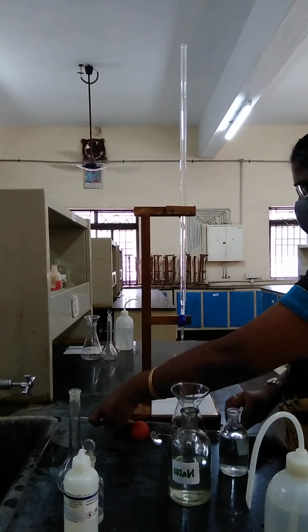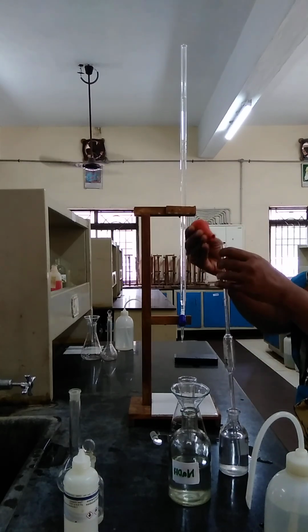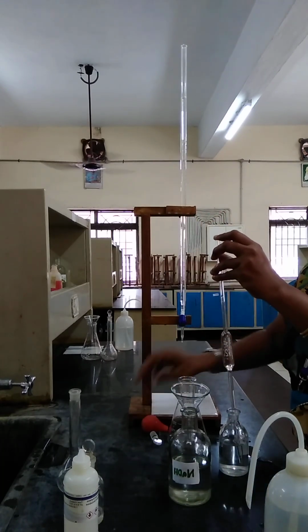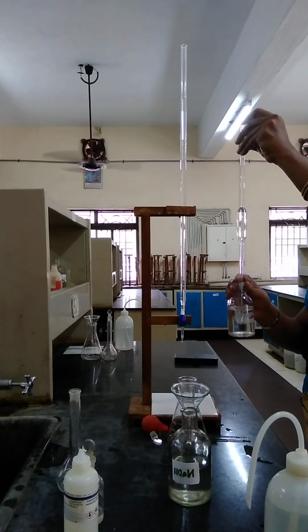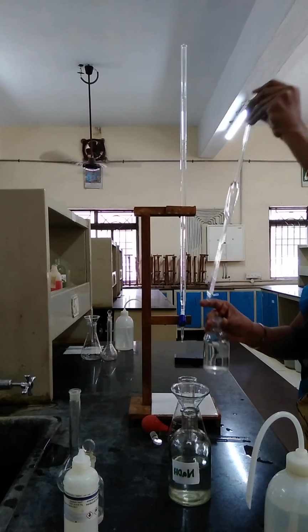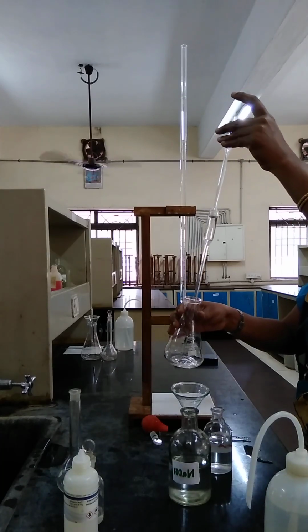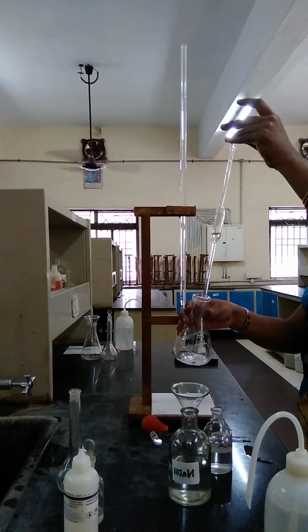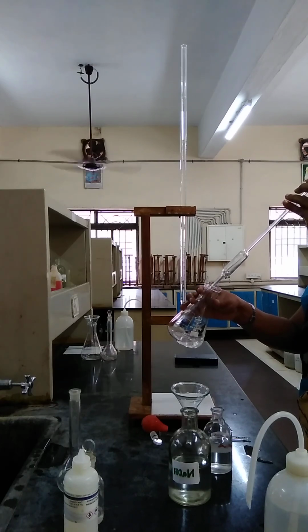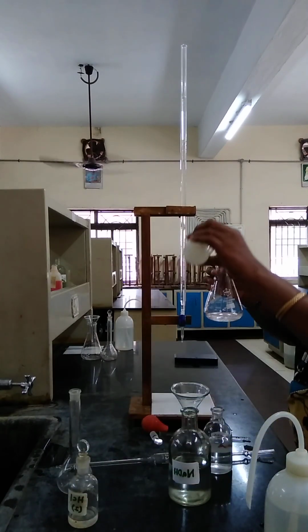Now pipette out 20 ml of oxalic acid for the second time using the rubber bulb, because due to the acid we use the rubber bulb rather than mouth pipetting. Now exactly 20 ml pipette out, there is no additional reagent, just dip and then take it out. Now we take the indicator, 2 to 3 drops of phenolphthalein.